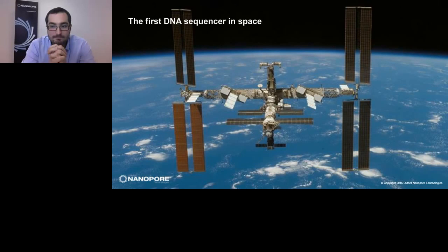One more question that has come in from Scott is, can you identify epigenetic markers? Yeah, that's a very good question. The advantage of not having to do PCR is that you're not sequencing a copy of a copy of a copy. You're sequencing the real thing. So yes, you can see epigenetic tags.